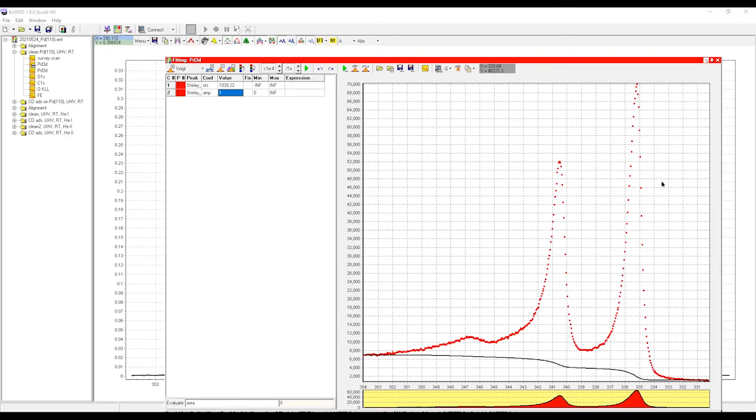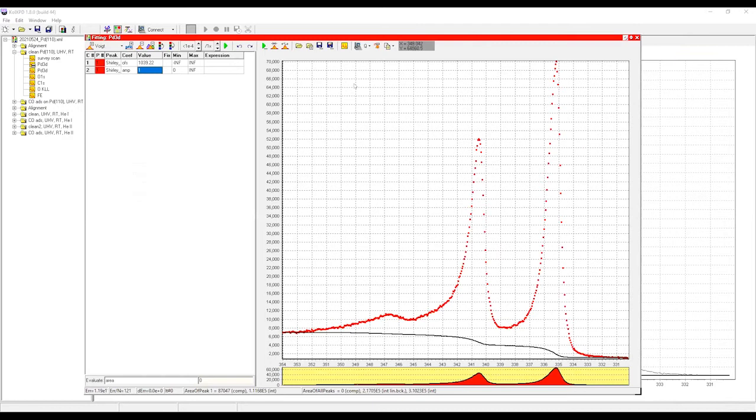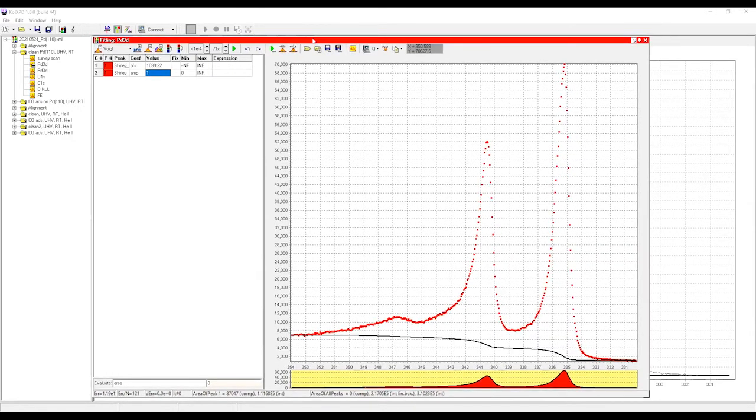So, as Misha said, this profile is not actually easy. And as I showed you today in the presentation, we deal with platinum mainly, which is similar. There is also a 4f doublet. It's also asymmetrical. And even if you have small nanoparticles of platinum, there's an additional doublet added in the spectrum.